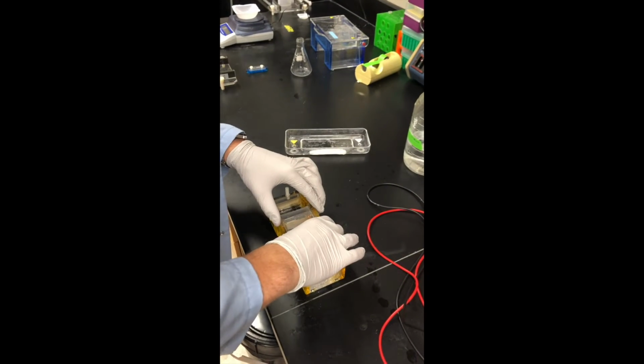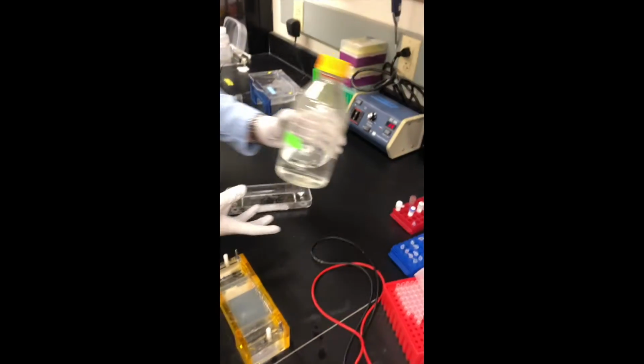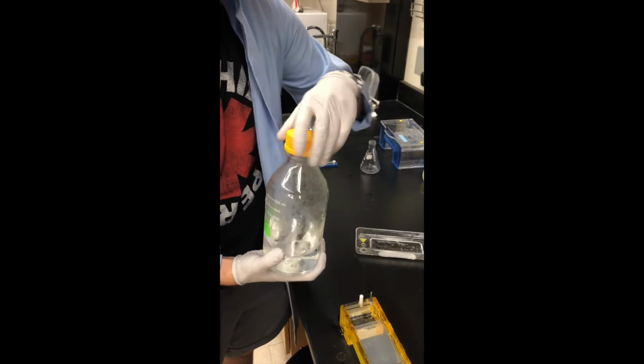Now the tank is full of TAE. We want to make sure that it goes across the top and covers it. If there's not enough, you can take it out of this jar and then just top it off a little bit.